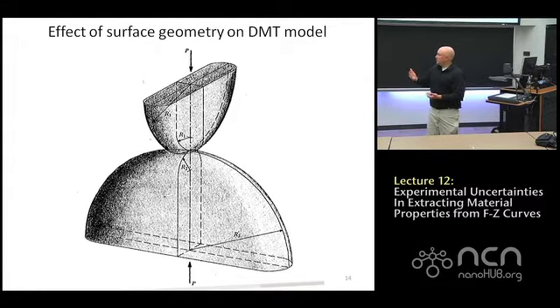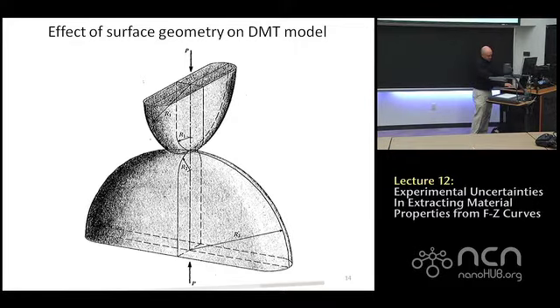He told me it would be a good idea to talk about more complicated systems. In general, you can expand Hertz or DMT into the situation where we have an ellipsoid interacting with another ellipsoid. This is a lot of equations, so I'll briefly run through and point out some main points. Let's consider an upper ellipsoid described by two radii, R1 and R2, and a lower ellipsoid described by two additional radii, R1 prime and R2 prime.